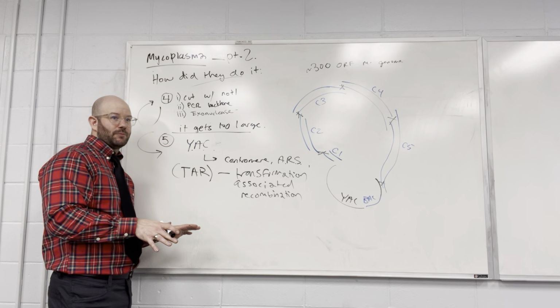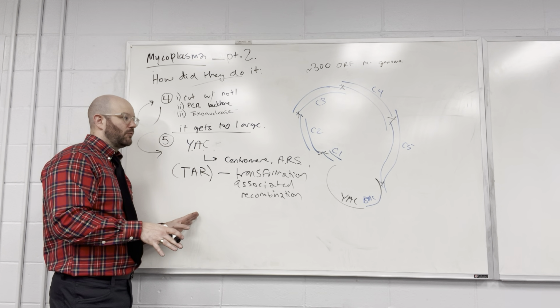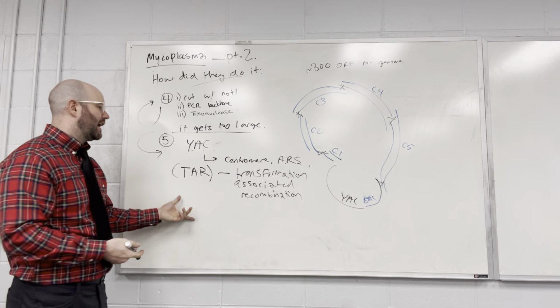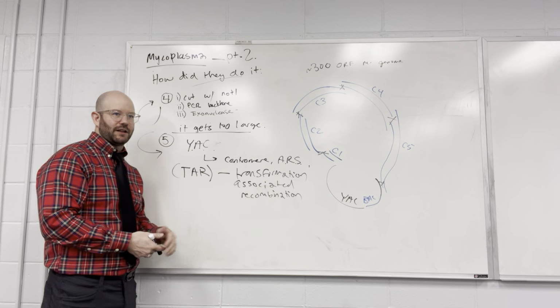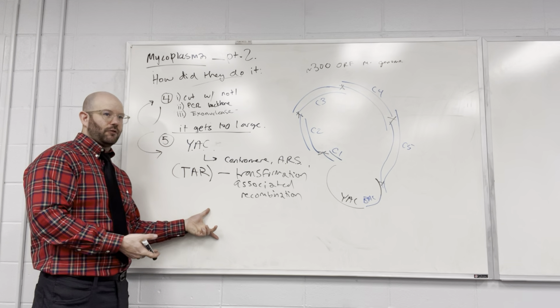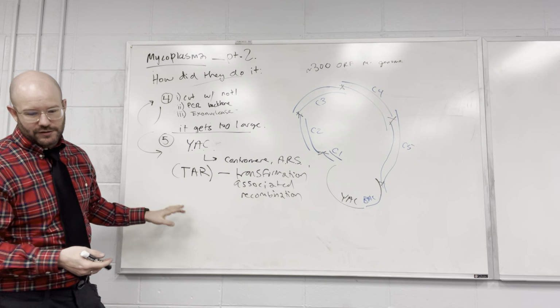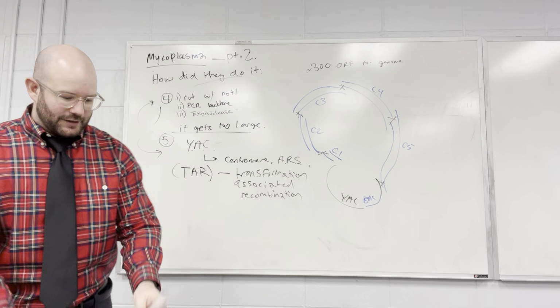E. coli is cheaper because an experiment that takes 1 day takes 3 days in yeast, unless it's not working. But yeah, hindsight is 2020. Maybe if they went back, they would just do the whole thing in yeast. I don't know for sure. Okay, so they get that assembly.